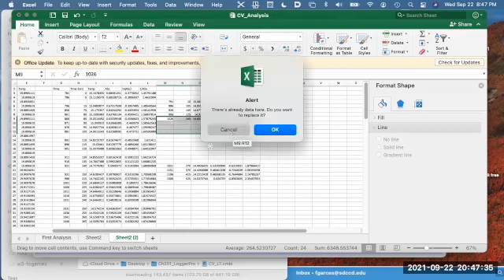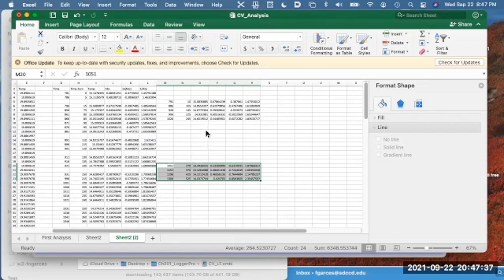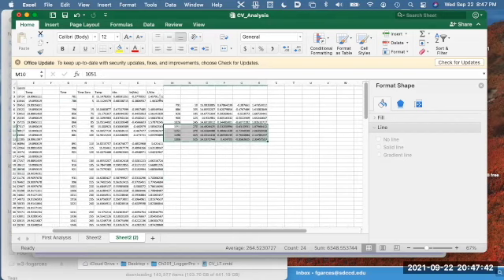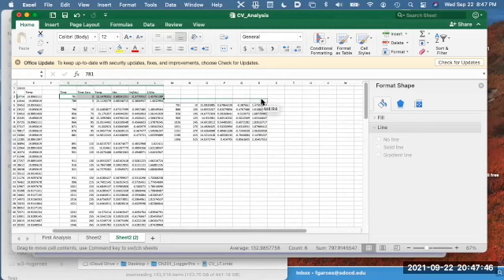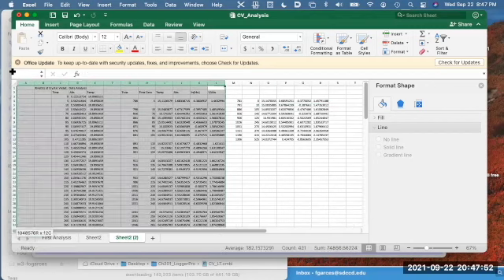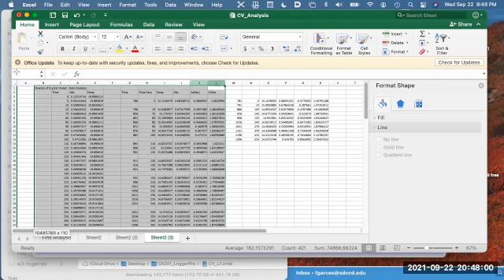Once I select the points that I want to graph, then what I can do is do the same exercise as I did just previously and start plotting absorbance versus time, natural log absorbance versus time, and 1 over absorbance versus time.